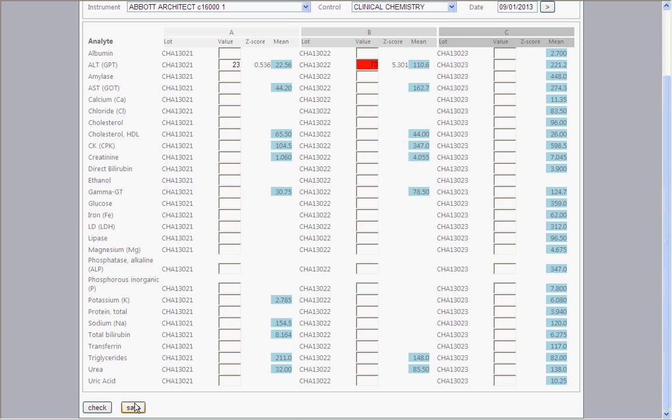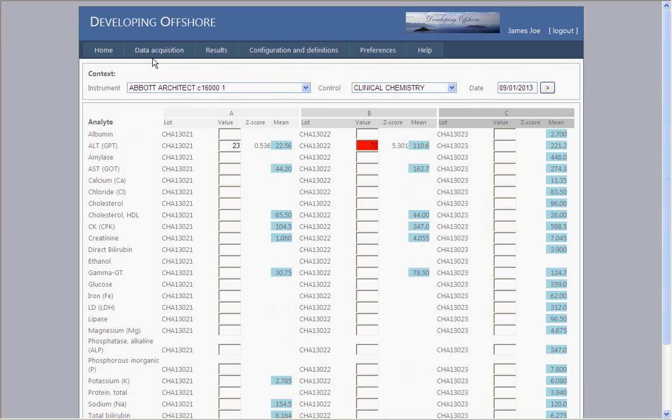You may acquire your data from a file, but of course you can imagine that different instruments and file hosts provide different files as there is no standard. We need therefore to configure one or more drivers to interpret those files and make them understandable to TQC. To configure a driver, select Data Acquisition and Drivers Configuration.